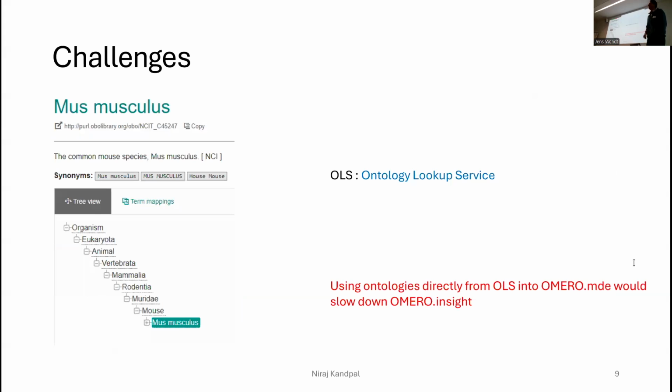Then Niraj also discussed some challenges we faced back then. One of which was that MDE also offers the possibility to include references to ontologies and then auto-populate the values with the ontologies. We made the experience that it then takes up to several minutes to just start the software because it's still pulling the ontologies.